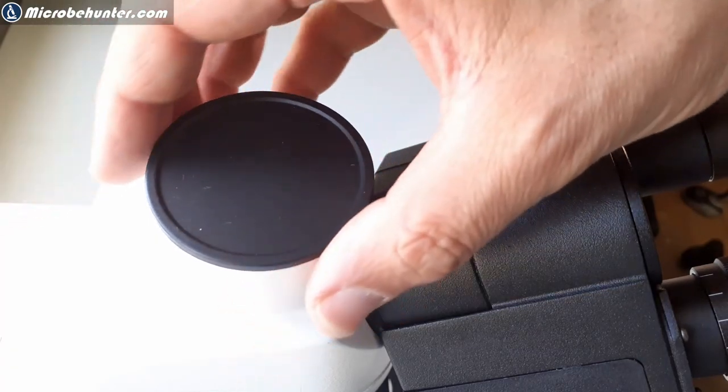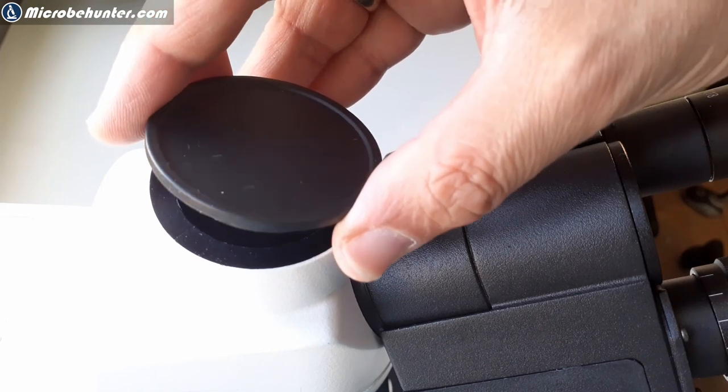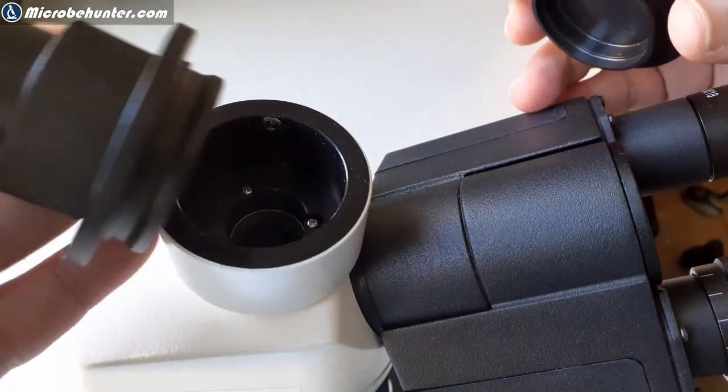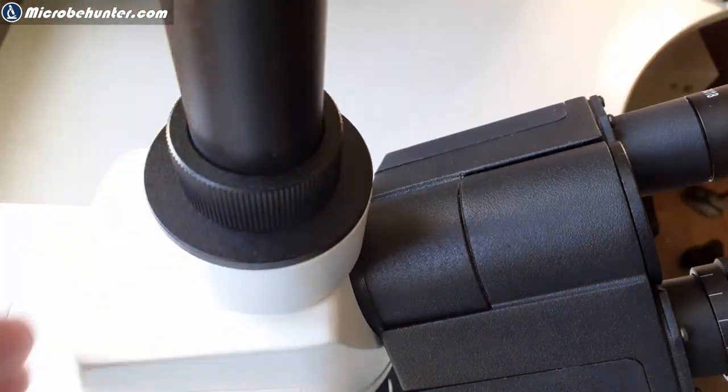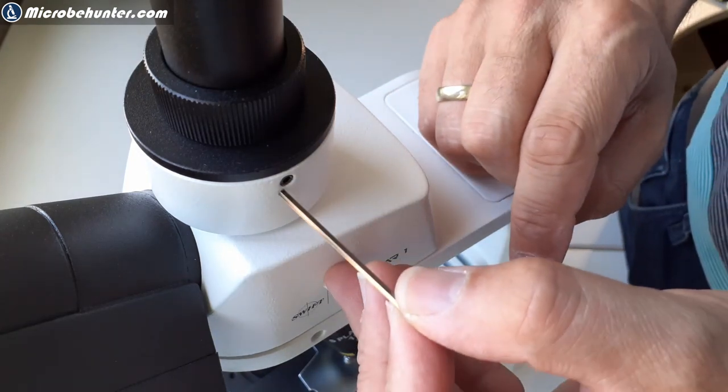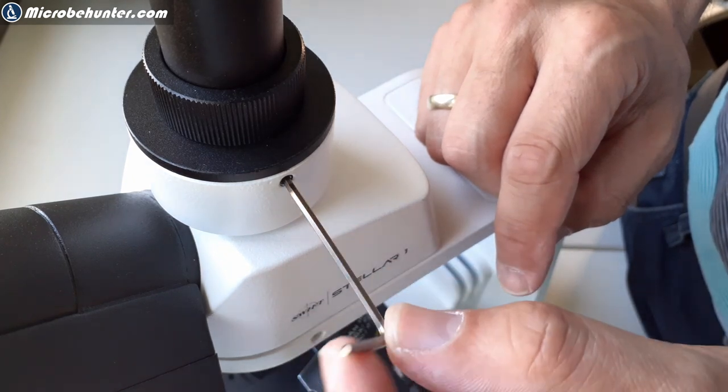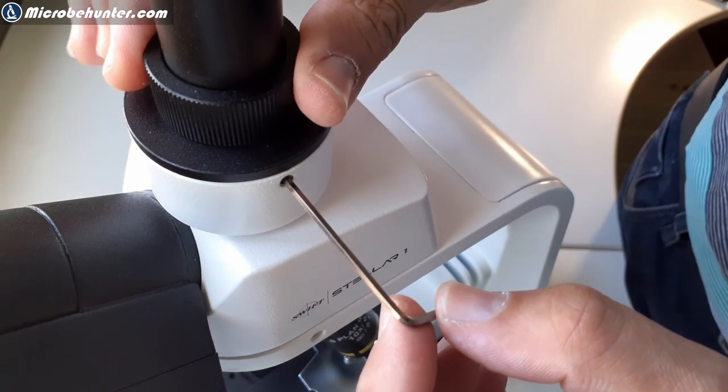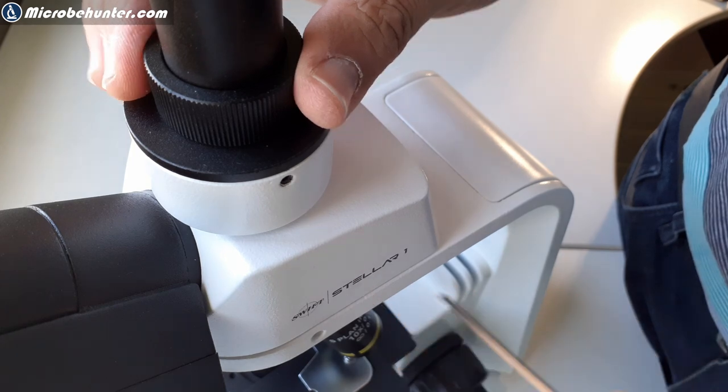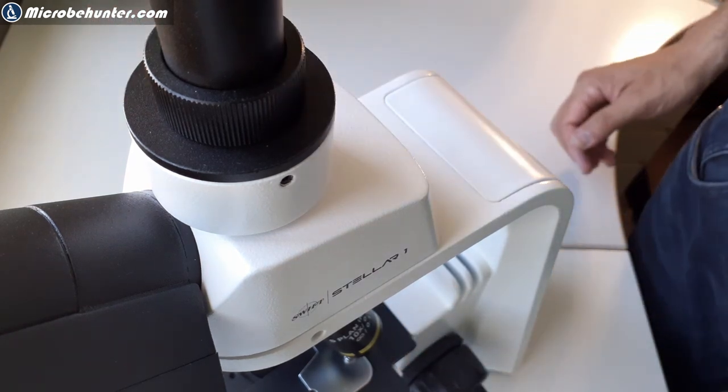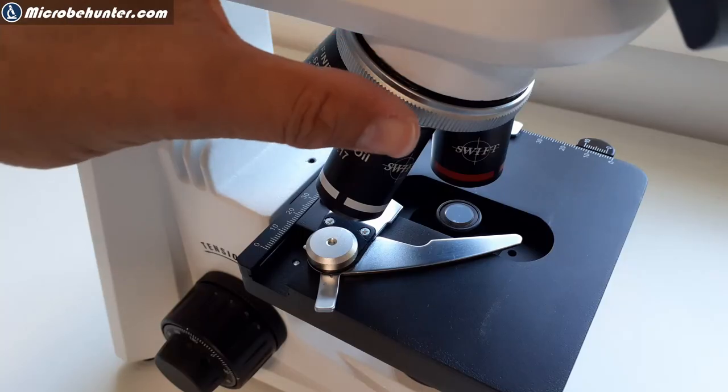As I mentioned already, a fairly decent instruction manual here. This is the power supply cable. It is powered by USB. This here is the photo tube, which I'm going to connect just now using a little hexagonal wrench tool, which is also supplied, some dust protective caps. These are for the eyepieces. And they also supplied a set of 25 times magnifying eyepieces in addition to the 10 times that were already connected. And this is a blue filter as well. And a dust cover. And I'm going to now connect the photo tube. So I'm going to remove now the protective dust cover here. And I'm just going to plug in the photo tube and using the wrench, I just tighten it and that's it. So it can be removed also quite easily for storage purposes. If in case the microscope is a little bit too tall for your cupboards, then you can also remove the photo tube quite easily.